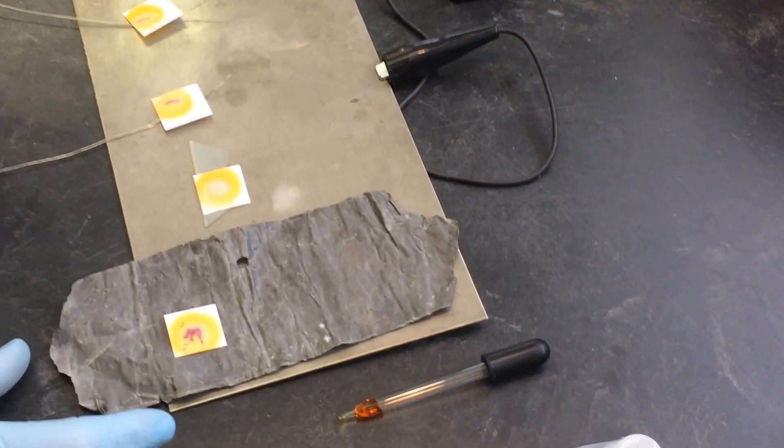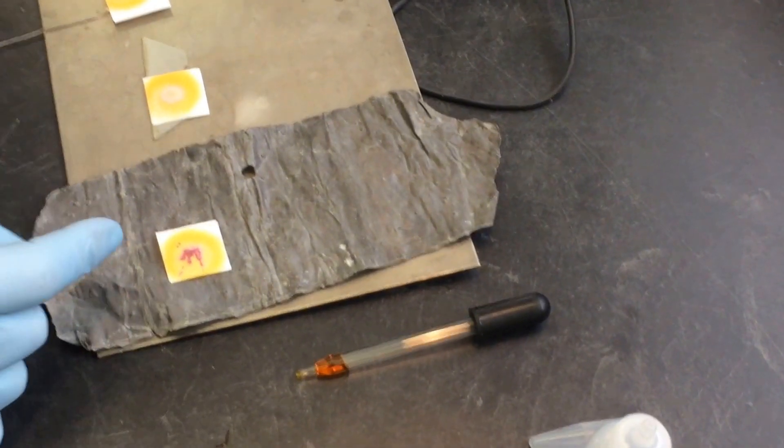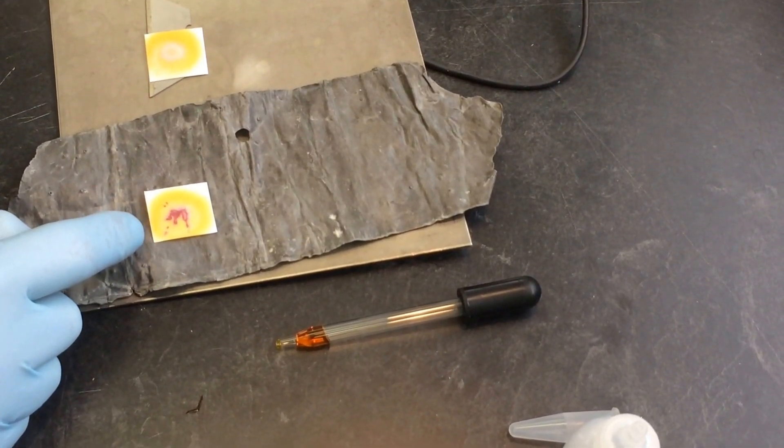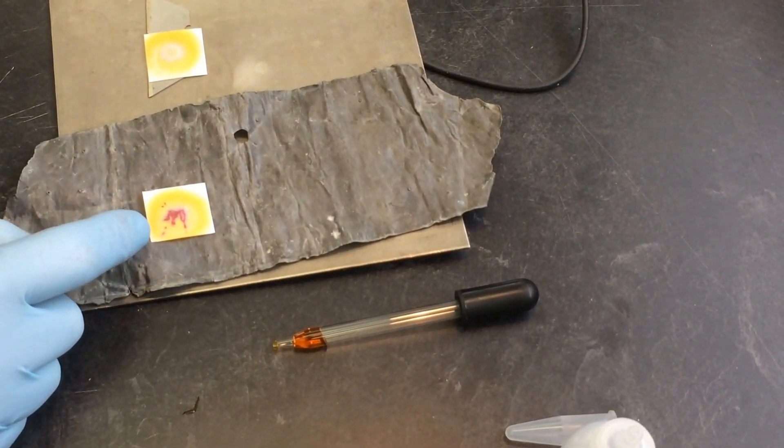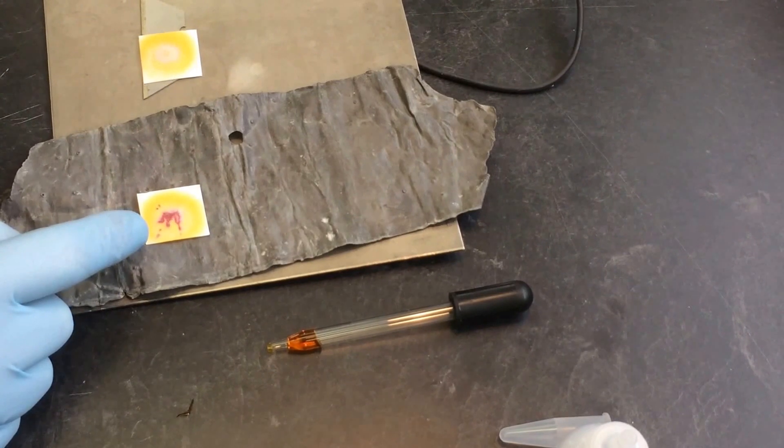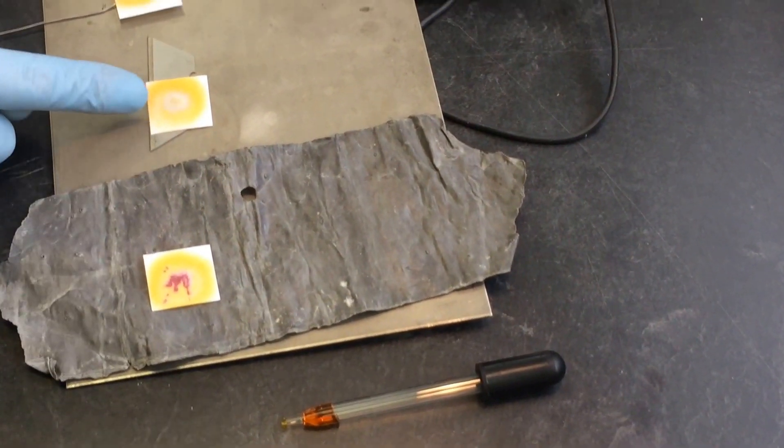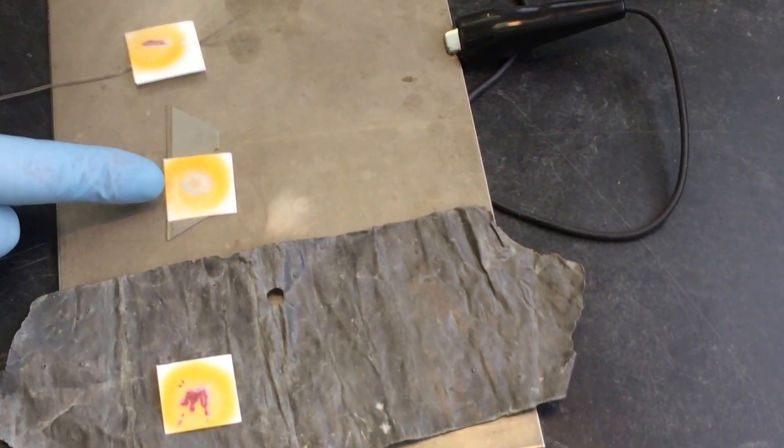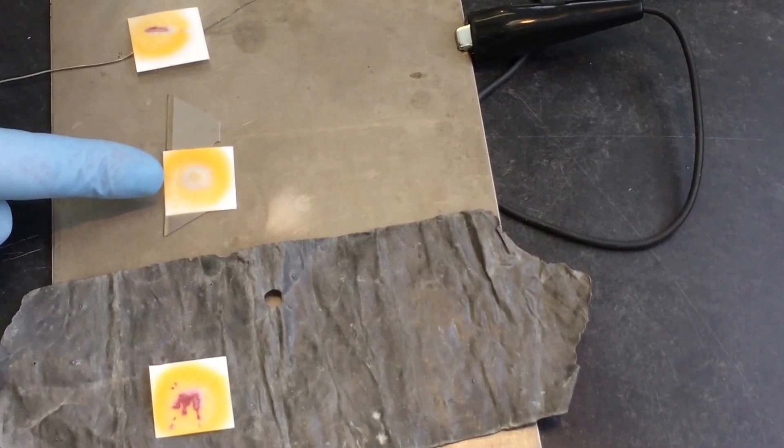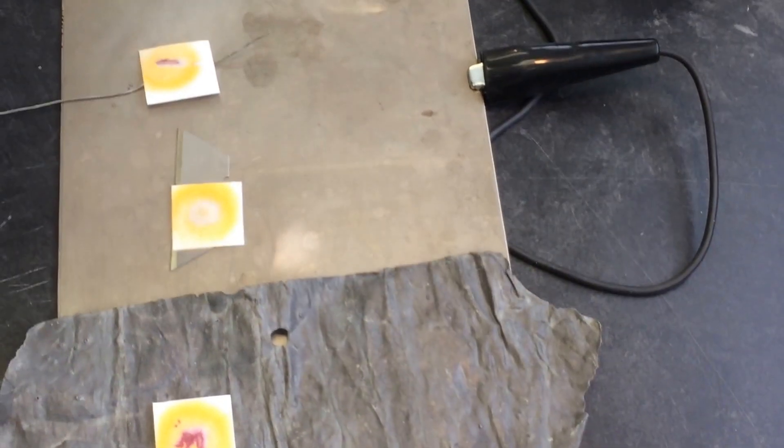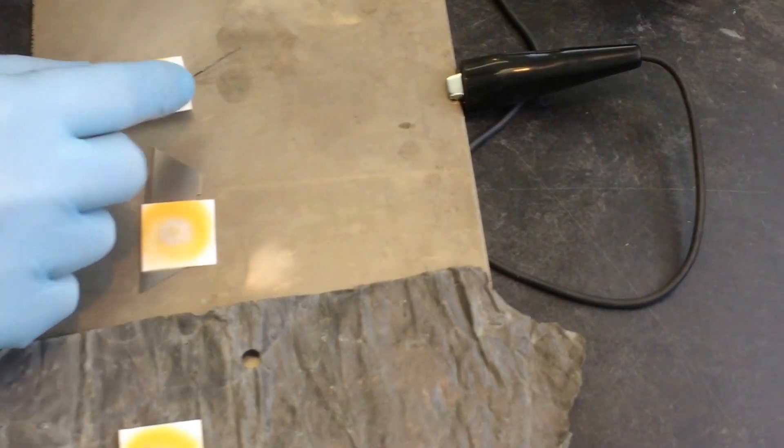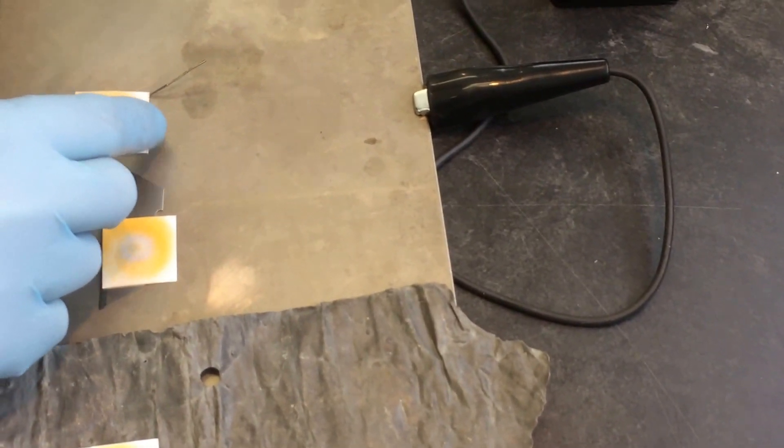Okay, let's observe the results. Well, obviously the first thing that jumps out at me is that the lead sheet gave us a really brilliant magenta color. The razor blade gave no trace of red whatsoever. The one that's labeled leaded solder, it seems like there is a red there. I could definitely observe red. It's not bright, but it's there.